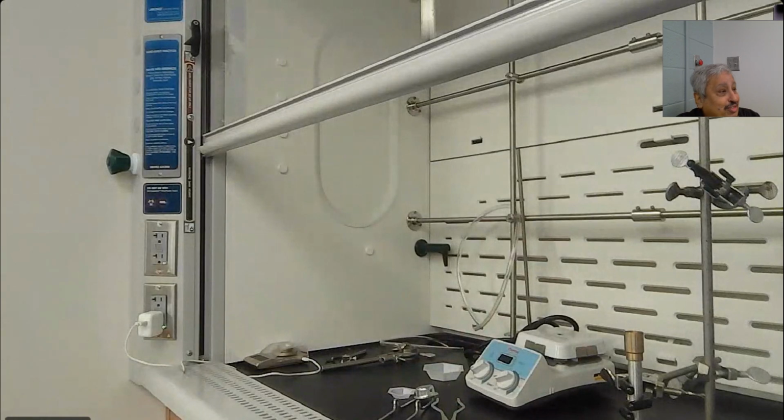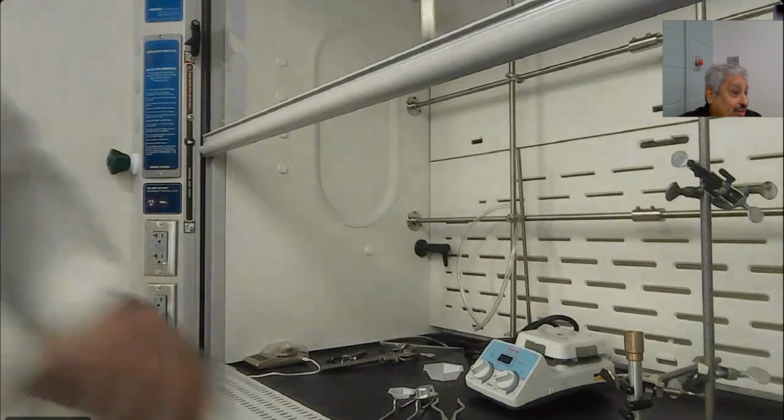It's a very nice hood. Those are the organic ones. They are brand new. Nobody has used those hoods in the organic lab yet, because they use micro glass equipment, so small, tiny. The hoods are very clean. Ours is not clean because we are working on the hoods.